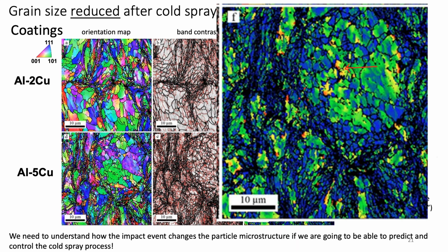And this is just zooming in so you can actually see some of the details. This is pushing on the hairy edge of what we can reliably do with EBSD. A lot of this black dropout that you see is just our inability to index those regions. We'll look at this using a higher resolution technique in a few minutes.